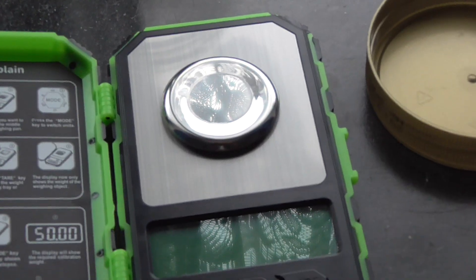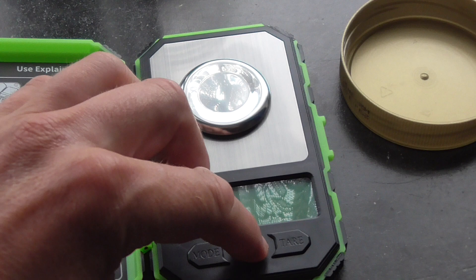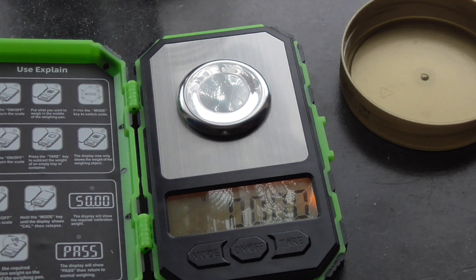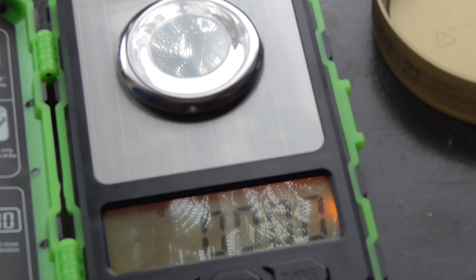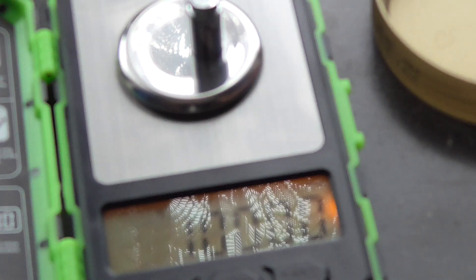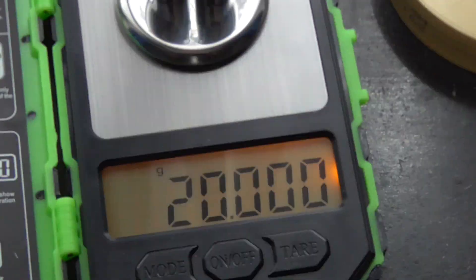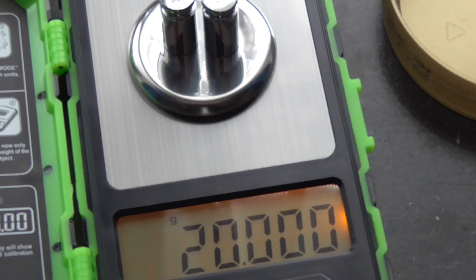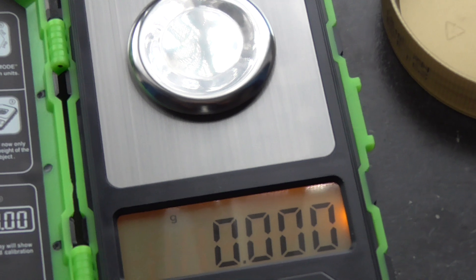It has already been calibrated with 20 grams. Let's check this — that's 10, there's 20. As you can see: 20 grams, 20,000 milligrams — this seems to be okay.